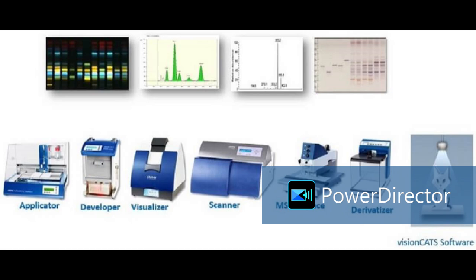These creams and toothpastes are creamy in nature, so any kind of tricky samples like creams, ointments, pastes, those also we can process and do HPTLC analysis. We have detected eugenol in brands like Patanjali Dantkanti, where they are claiming that they are adding eugenol or clove. To show the presence of that, we can use this method.